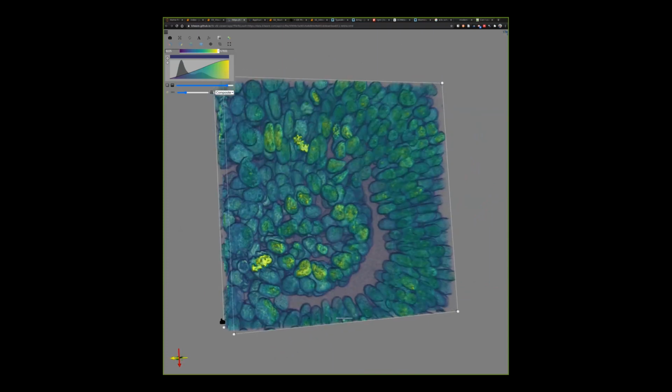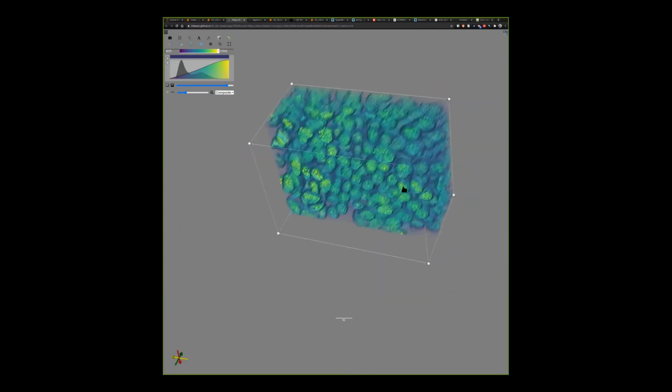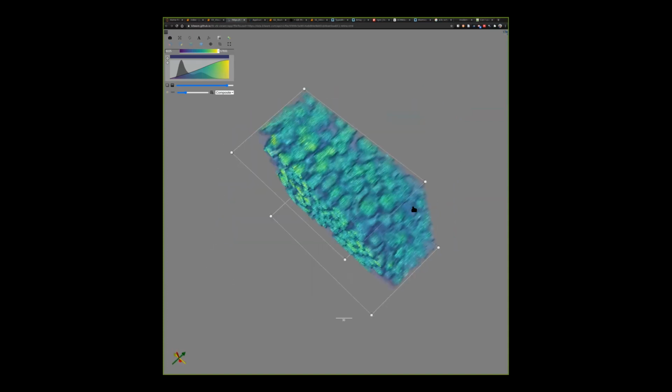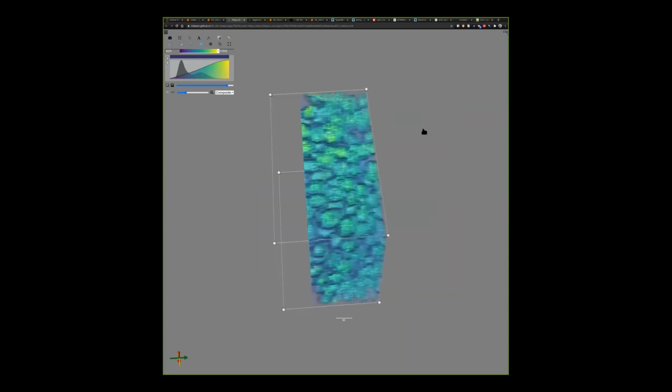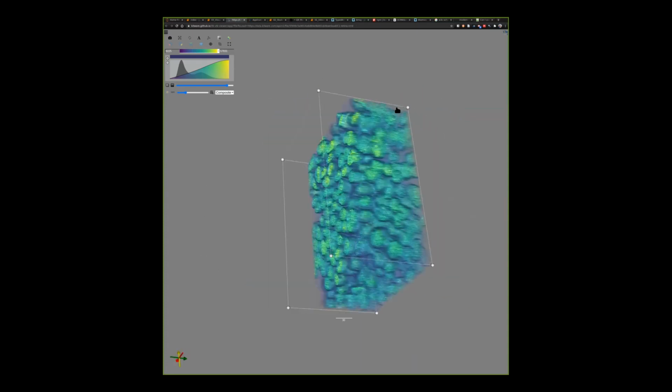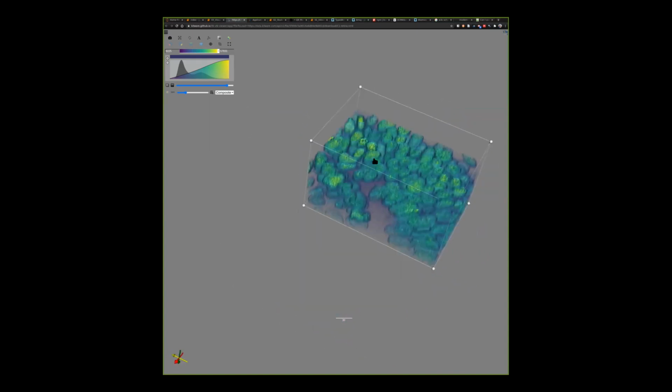Where it's going is you'd be able to select a region of interest on one of these multi-scale Zarr data sets, for example, and then it'll lazily load a high resolution version of that region of interest. That's the concept in NeuroGlancer and BigDataViewer, if you're familiar with the desktop ImageJ or Java application. So that's coming with just HTTP.